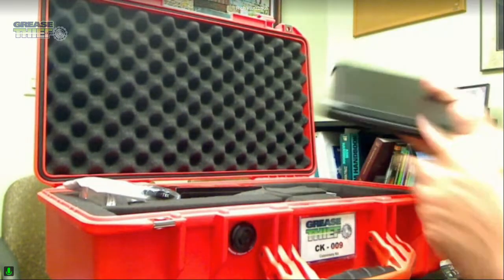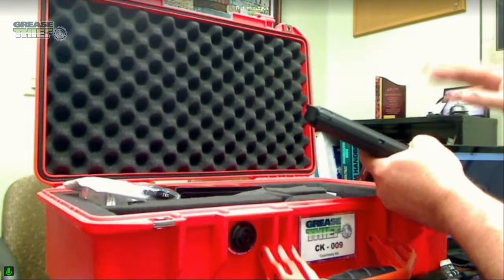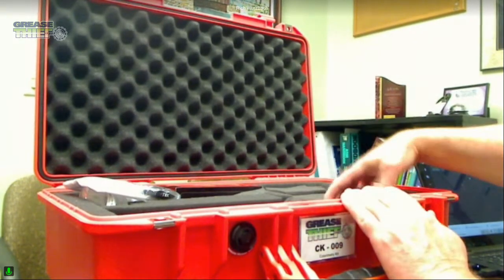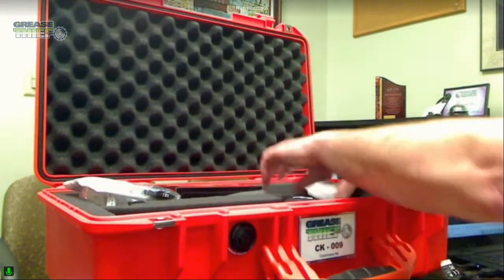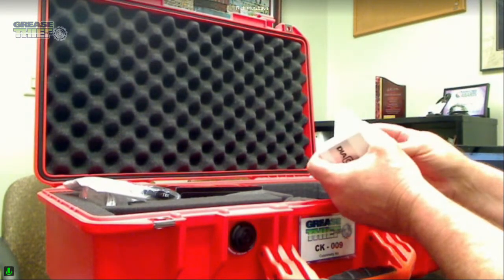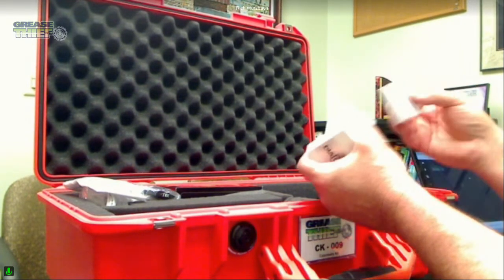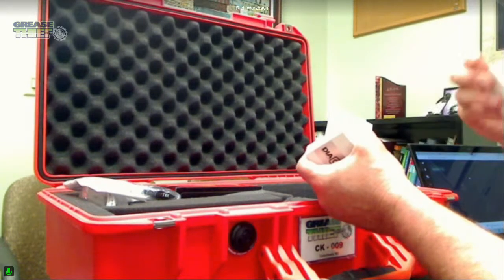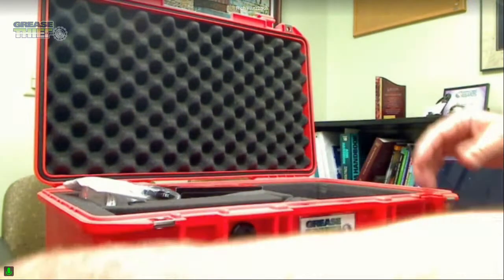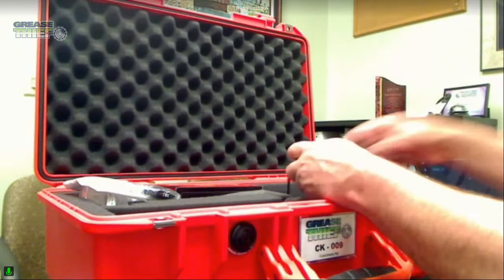This is going to be the iPad. I'm not going to use it for this demonstration, but the iPad has some software loaded on here that allows us to do the colorimetry measurement and save our data. We then have some other supplies here, like for instance, this here from a color perspective is going to allow us to fill these small liquid cells, and we could do oil analysis at the same time. So we could establish what the hydraulic fluid, the gearbox oil should look like and so forth, and do kind of an on-the-fly color test of those as well, maybe even some coolants or something like that. But we're going to focus right now on grease analysis.